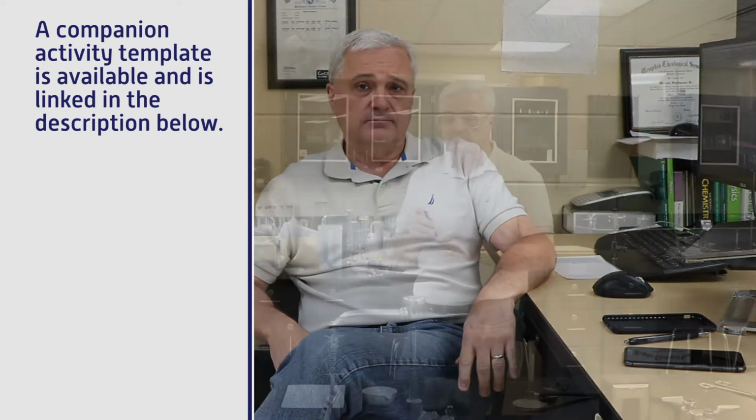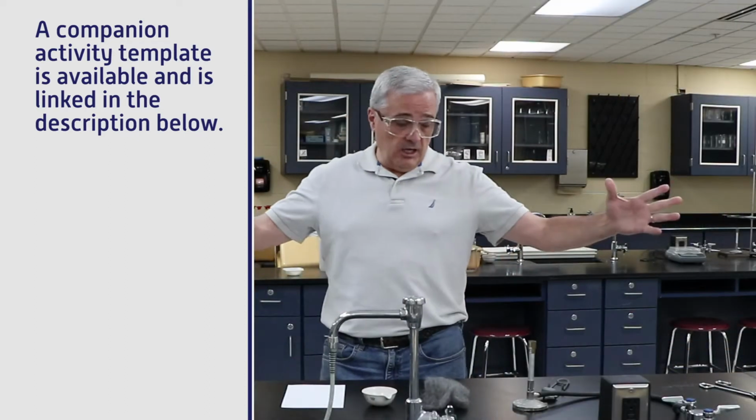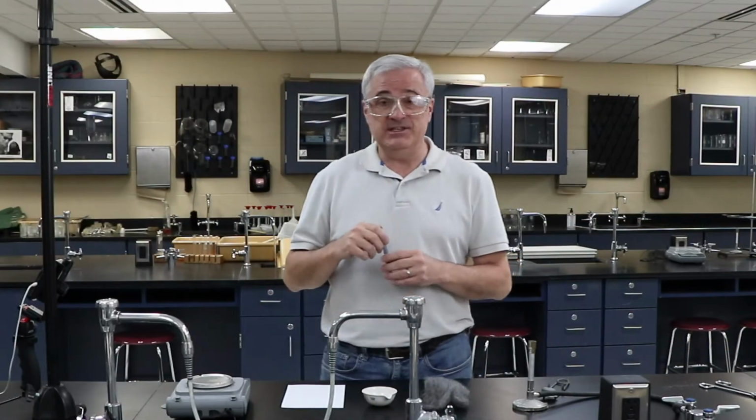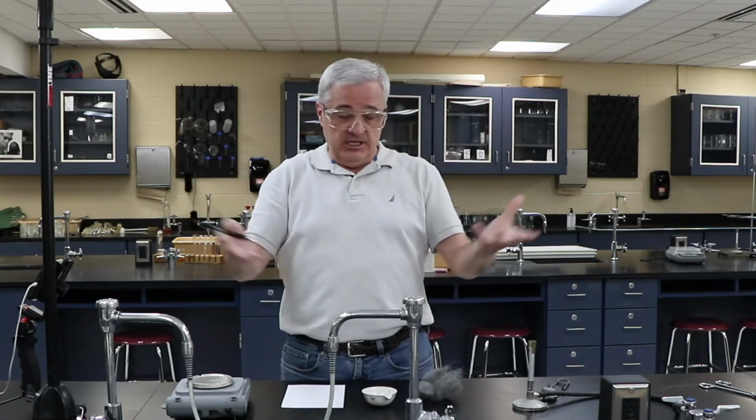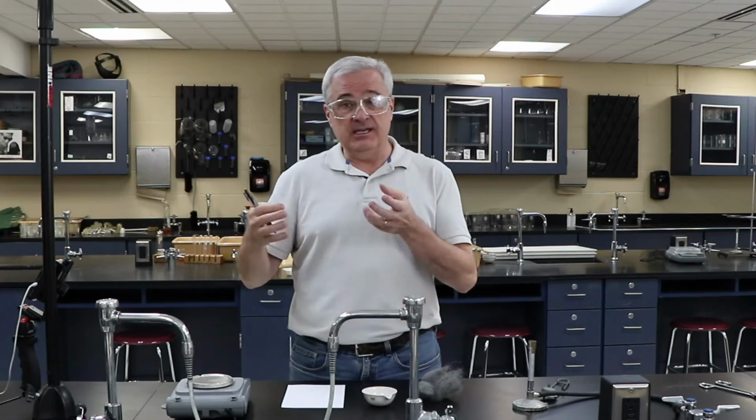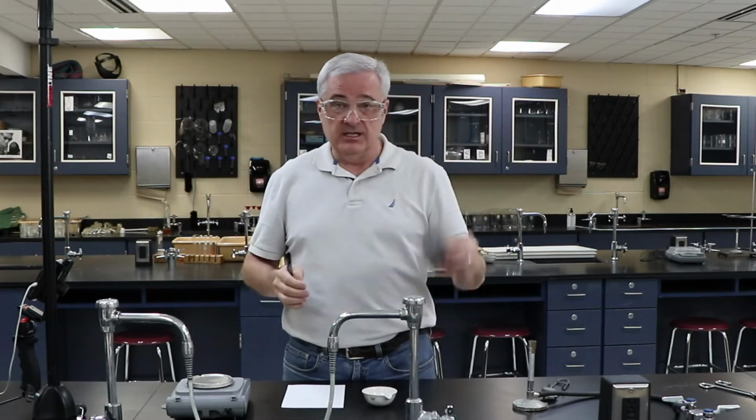Synthesis type of reaction. All right, here we are. We're ready to do a synthesis lab. We're going to take some of this and we're going to add some of this, and we're going to get something that is a combination of this and this.